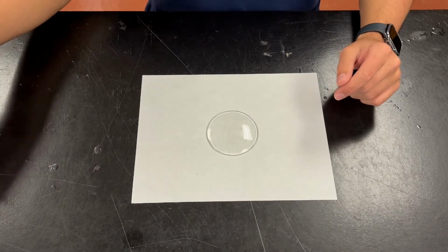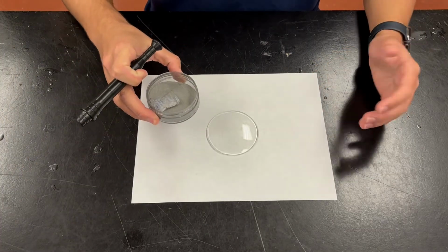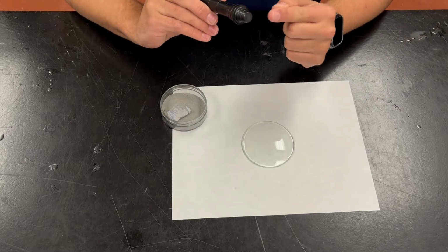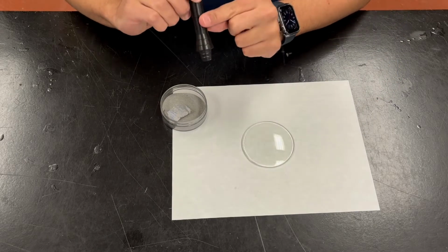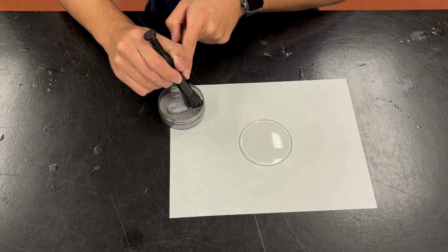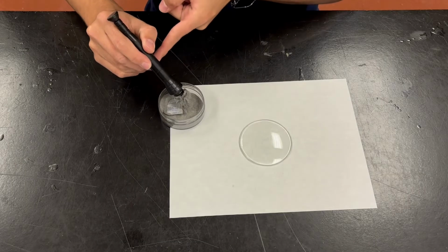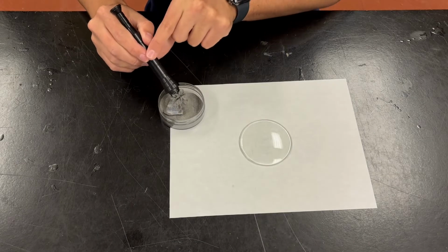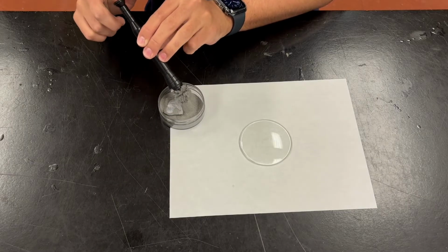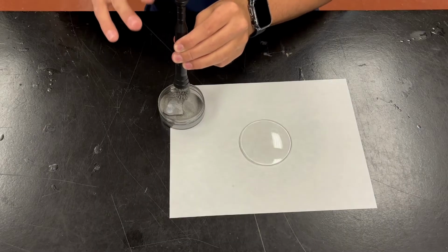Okay, moving on to the steps. We will start by opening our magnetic powder container, which I already have open. We're going to get your brush. Remember, this is the part that has the magnet, so you're going to place this part on top of the powder. It's unlikely you will mess this up because the magnet does all the work. You see how it attracted all that powder? Well, that is too much. Even with magnetic powder, you could add too much. So you'll do what we always do. Gently tap the brush to get rid of the excess.